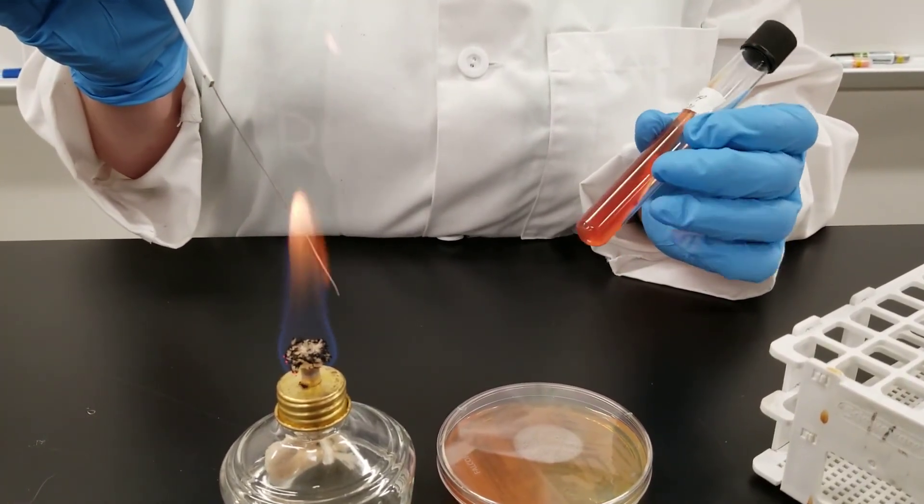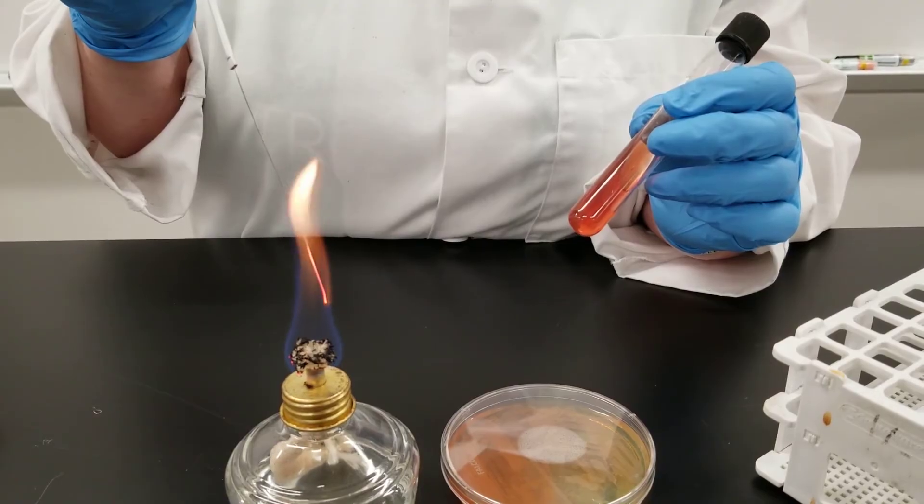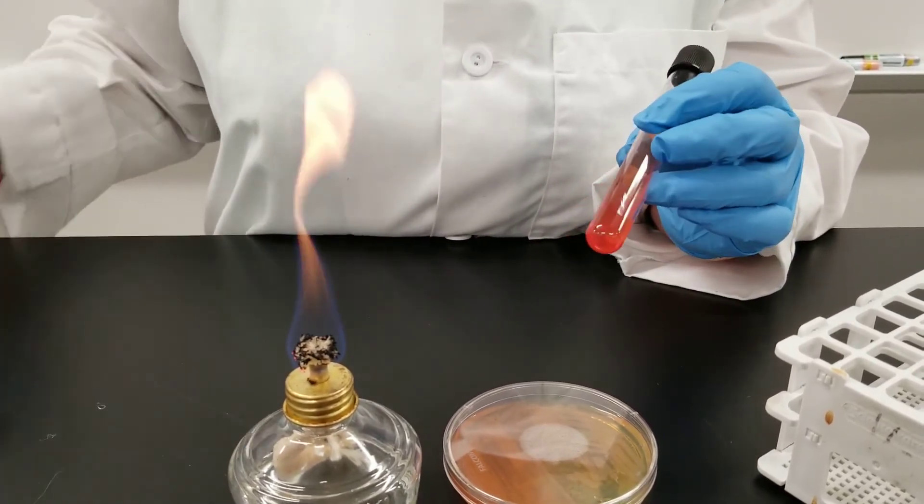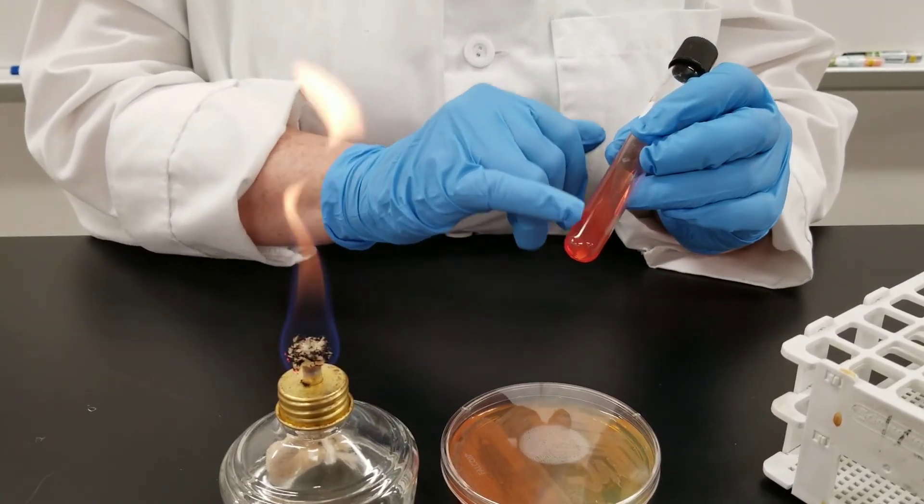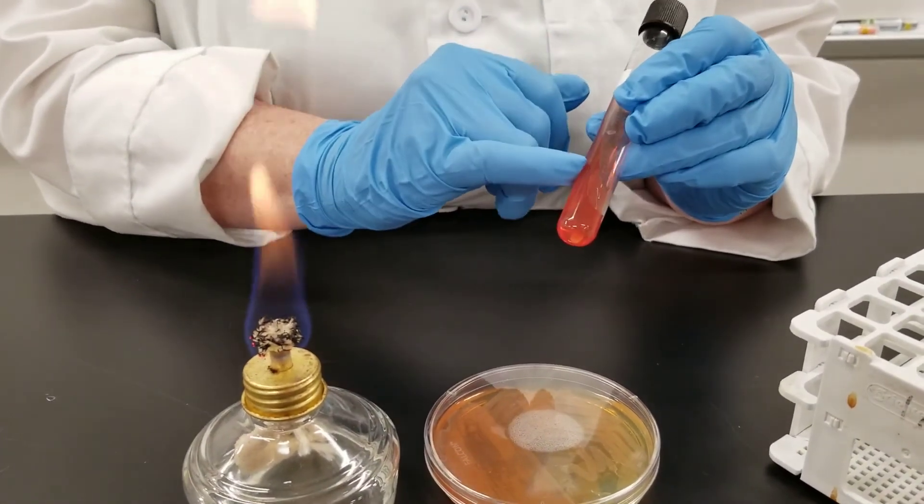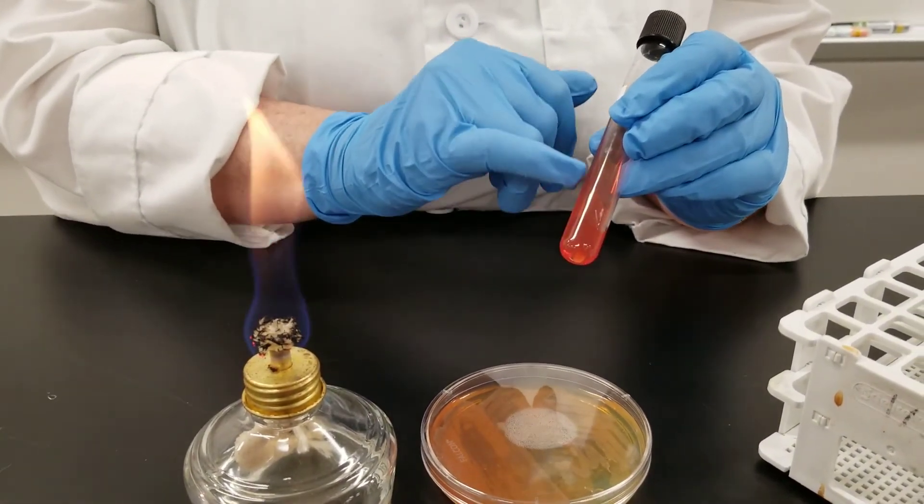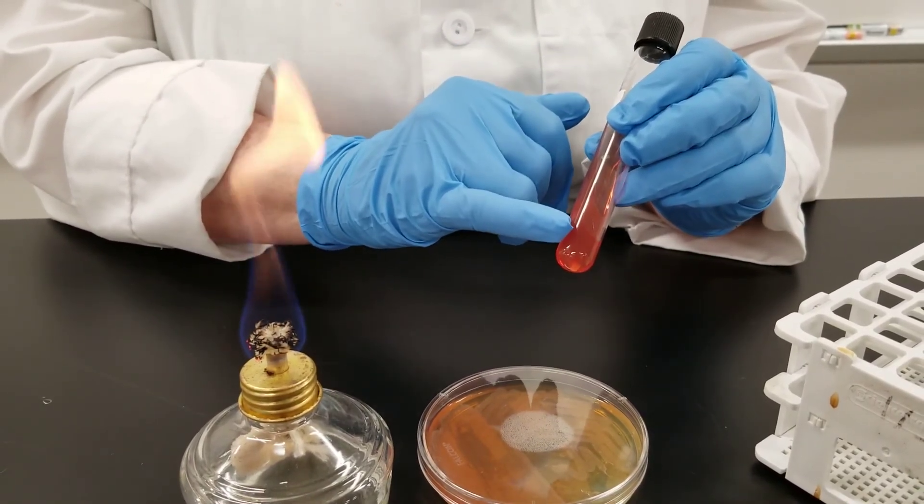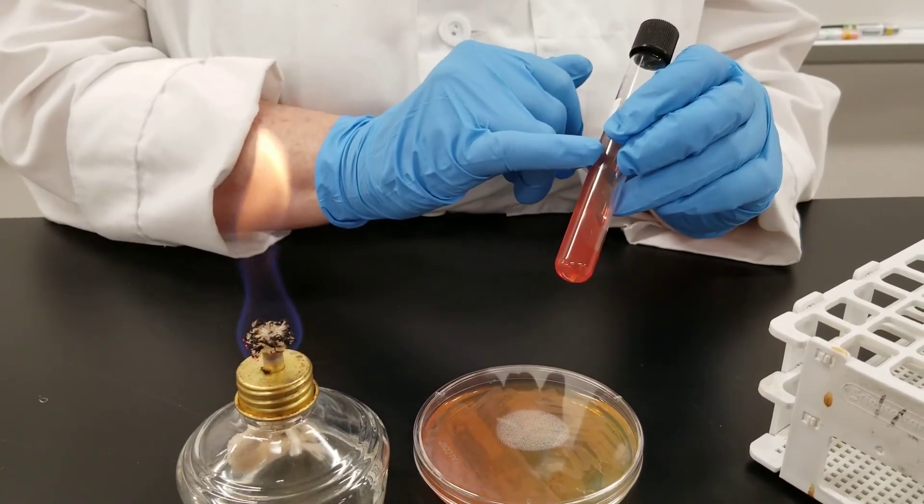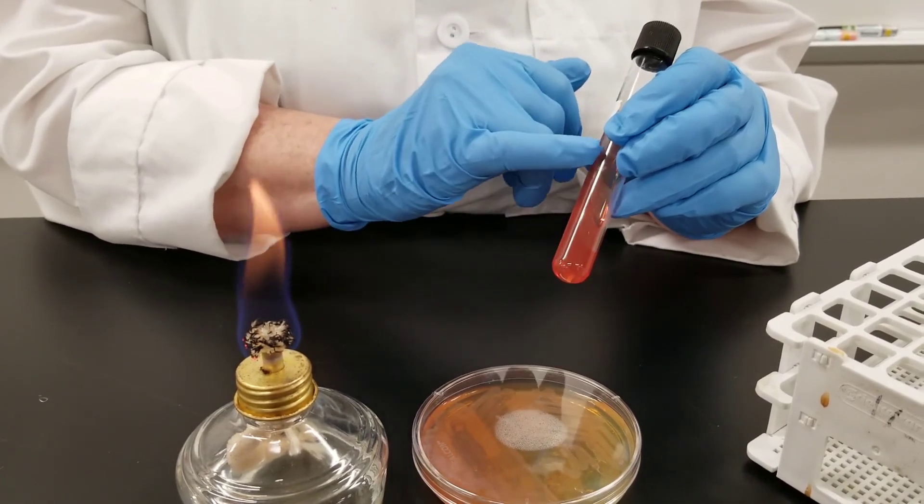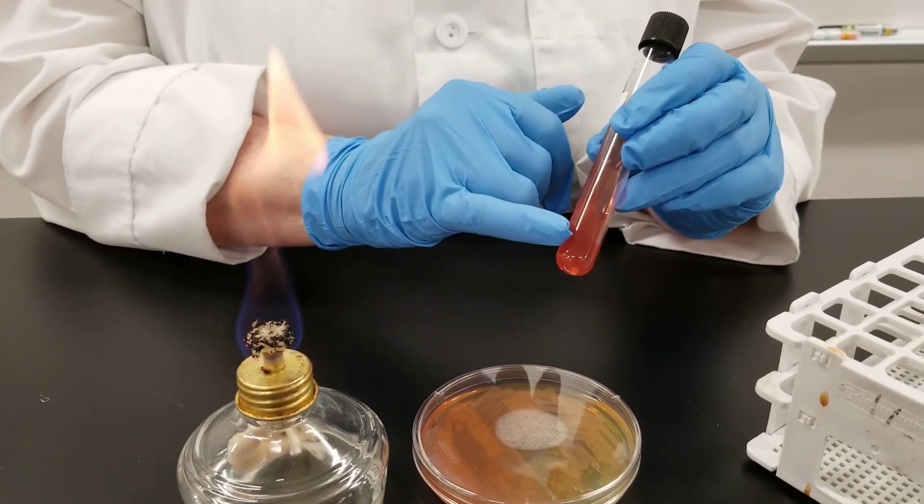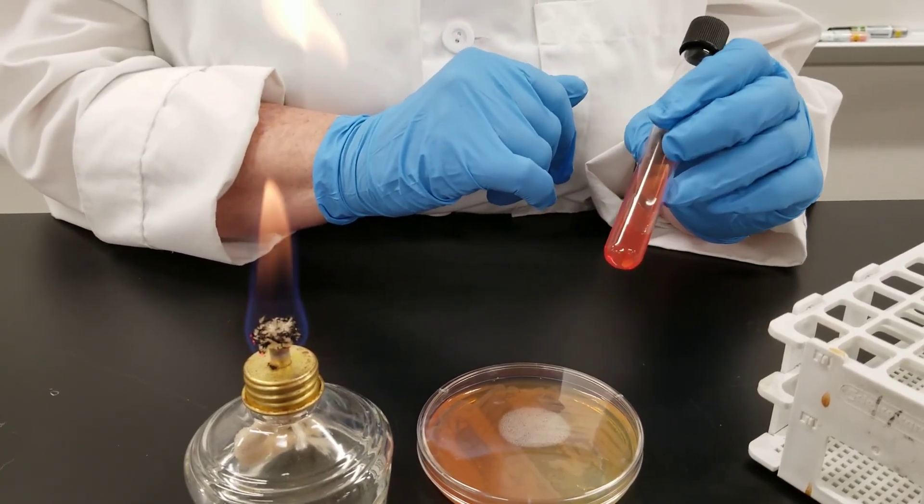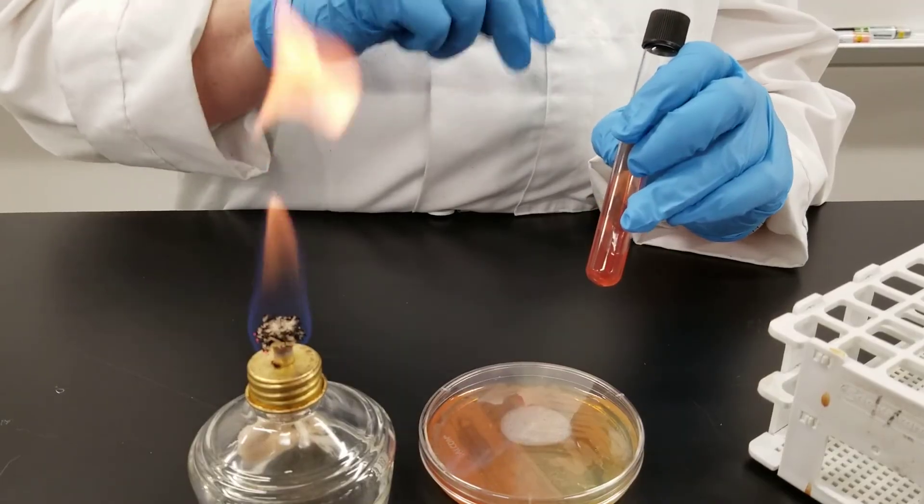What we've done is the bottom part of the tube, set this aside to cool. We have inoculated down in this area. This is the slant, this is the butt. We are going to look, depending on the organism, sometimes you get different results on the slant versus the butt. So that's what we are looking for. Some organisms you will get the same result, some you will get different results. So that's what we're going to be looking for. That's why we have to stab down into the butt.